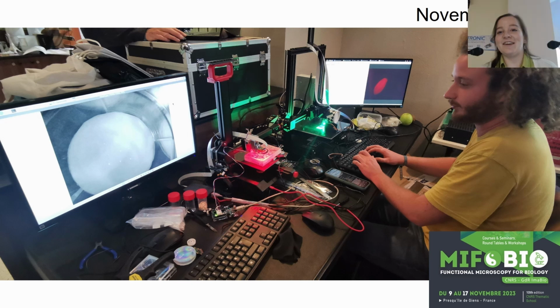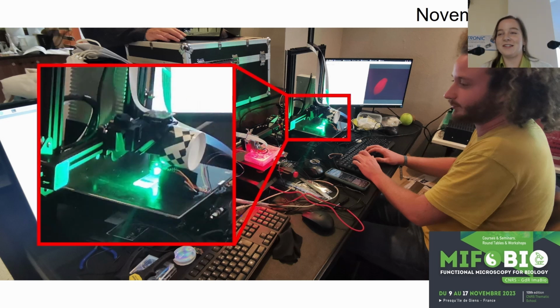So here are the first 2 EnderScope variants that were created around this time last year at MIFOBio. And this was Jerome and Hugo who made these. And they did a demonstration to other researchers about how the EnderScope works. And you can actually see one of these modifications outside. But I don't think it includes the coffee cup anymore. I think that was an early prototype.